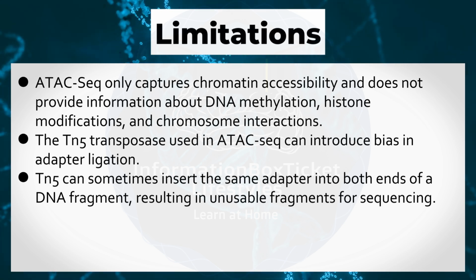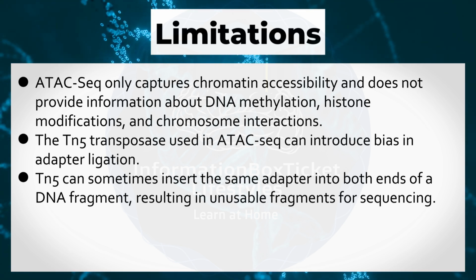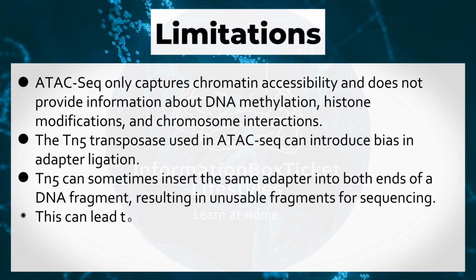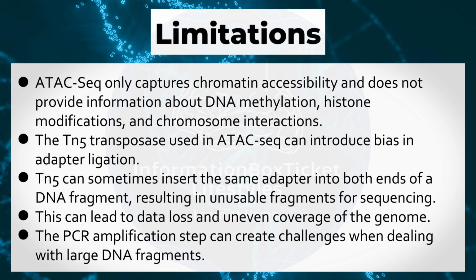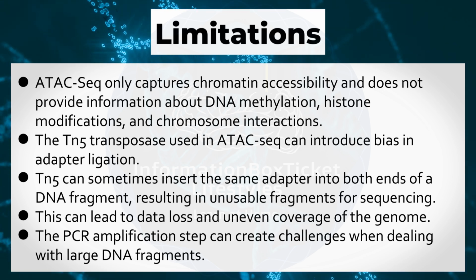Tn5 can sometimes insert the same adapter into both ends of a DNA fragment, resulting in unusable fragments for sequencing. This can lead to data loss and uneven coverage of the genome. The PCR amplification step can create challenges when dealing with large DNA fragments.